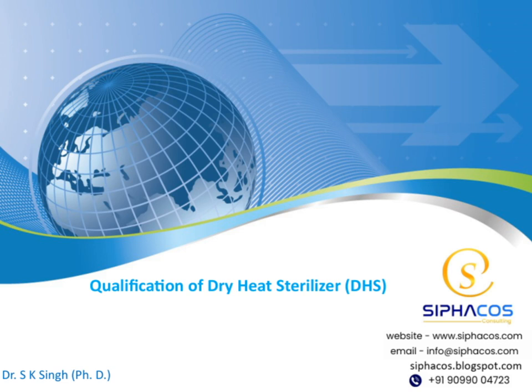Today, we will be discussing the qualification of dry heat sterilizers. I'm excited to take you through this important topic. Over the course of this presentation, we'll cover the key aspects of sterilizer qualification, including the processes and standards involved. So, let's get started and explore this essential subject together.